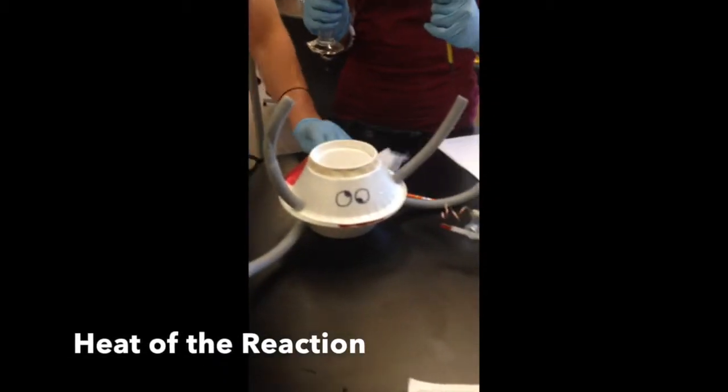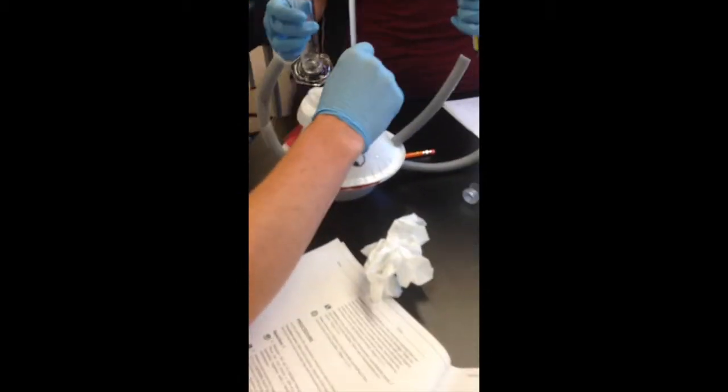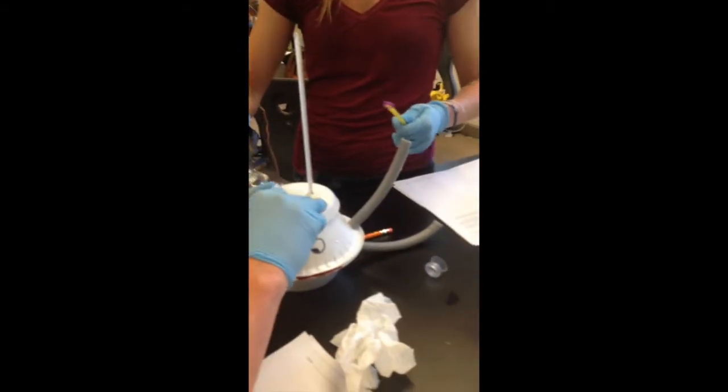Now we're doing our third reaction, and it's a legitimate reaction this time because we have two liquids. We've got 50 milliliters of hydrochloric acid and 50 milliliters of sodium hydroxide. They'll react, which will release heat in the calorimeter, which we're going to measure.